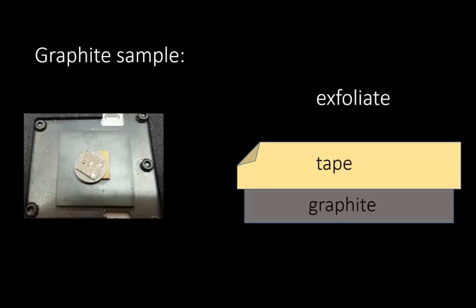For this lab, you will be using a graphite sample. Before imaging and measurement, you will have to exfoliate the surface of the sample. To do this, you attach tape and peel it off. This will uncover a fresh graphite surface.